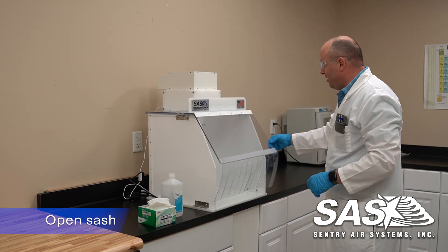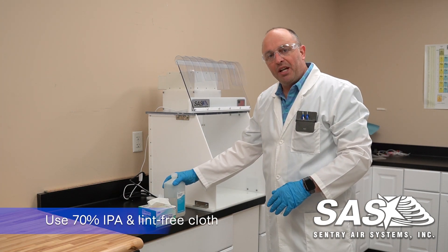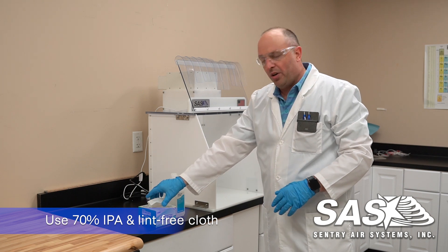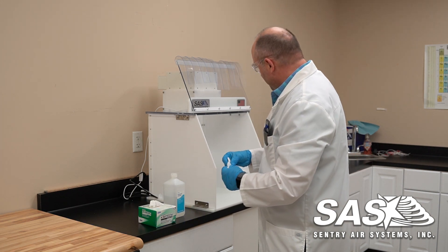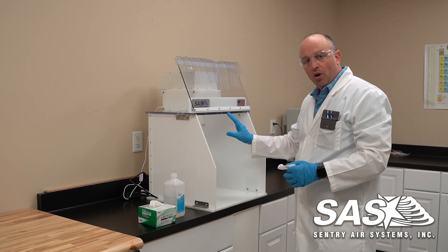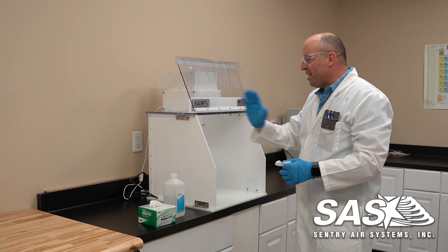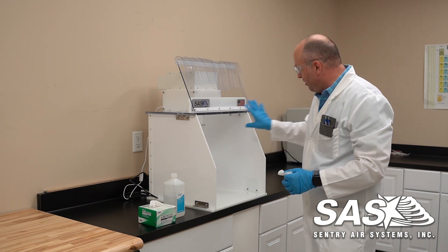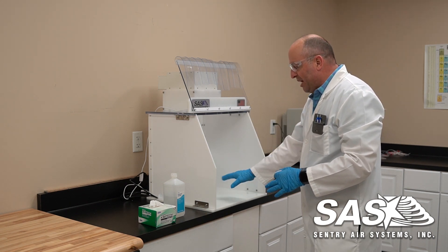We can open the front sash here — this will stay up for us. We recommend using 70% isopropyl alcohol as well as lint-free cloths. The process we use to clean this is we're going to start from the back wall and work from top to bottom. Make sure you overlap your wipes, move to the sides top to bottom overlapping your wipes, and then go to the bottom and do the same process.